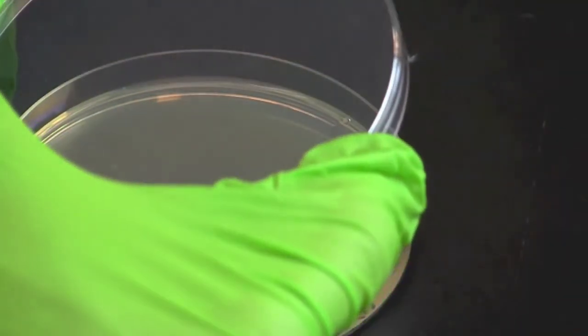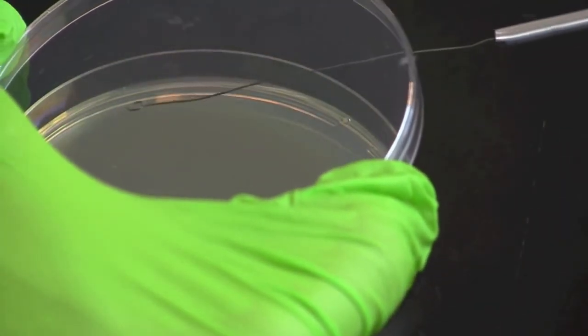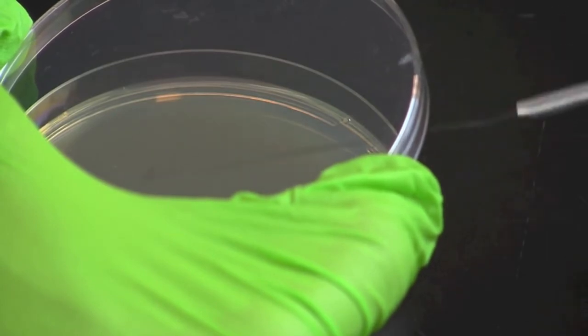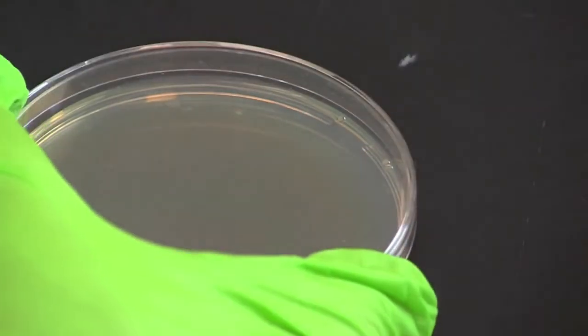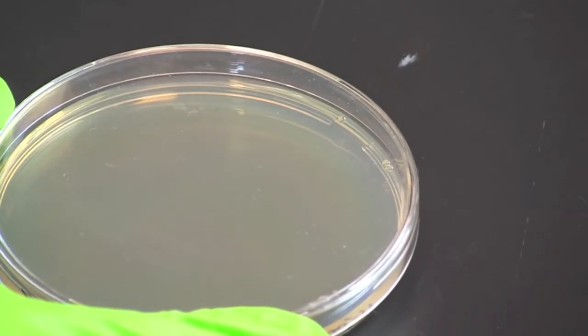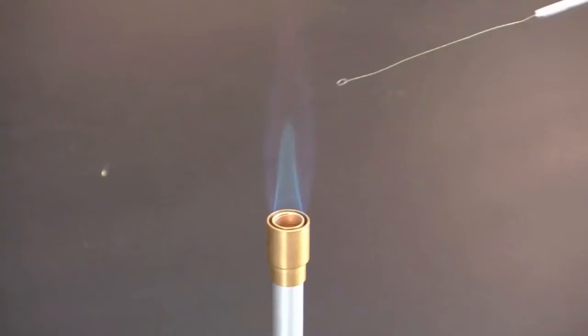Repeat the process one final time in the fourth quadrant. Flame the loop after completing the streak plating.